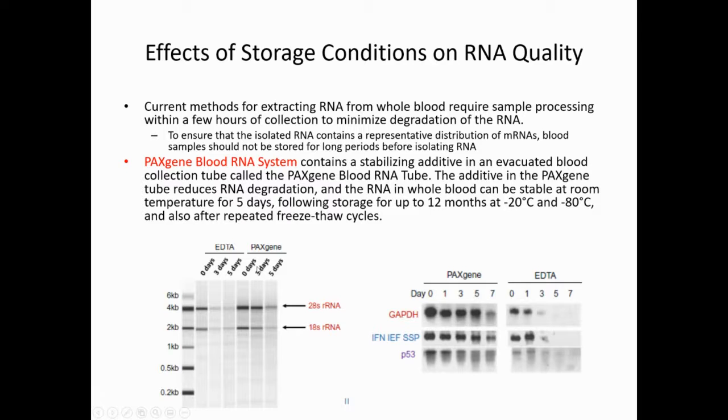And here is a comparison: if you collect the blood in an EDTA tube, after 5 days you see the ribosomal RNA degraded. After 5 days, the EDTA cannot preserve well. See, the PAXgene tube can preserve well, right?